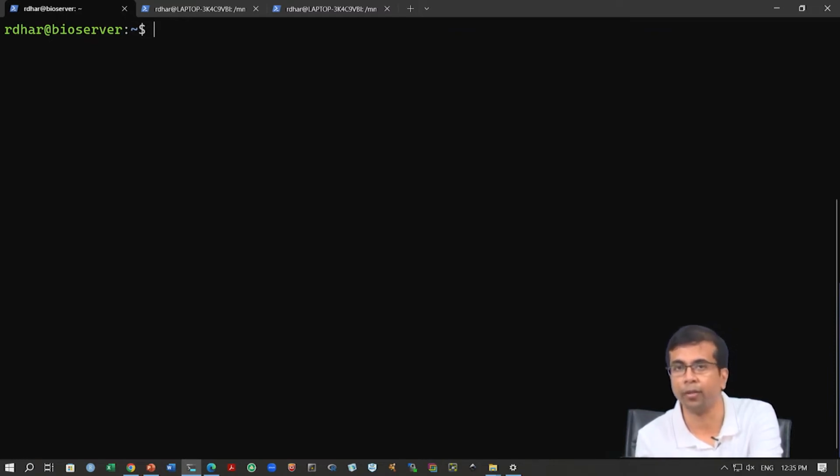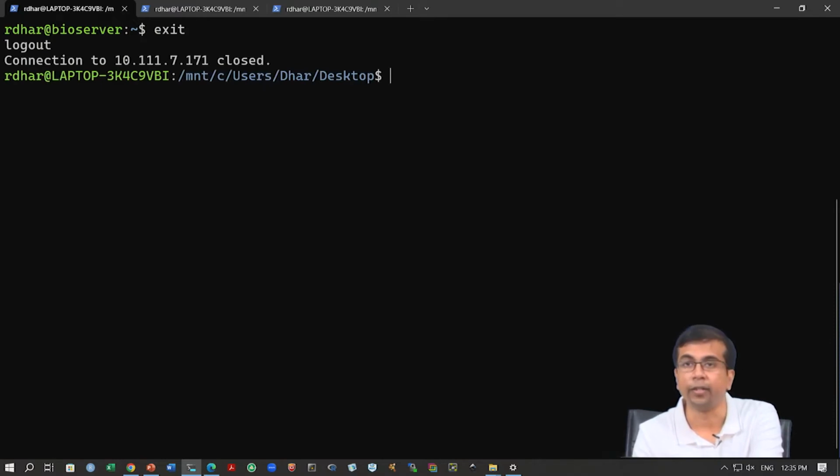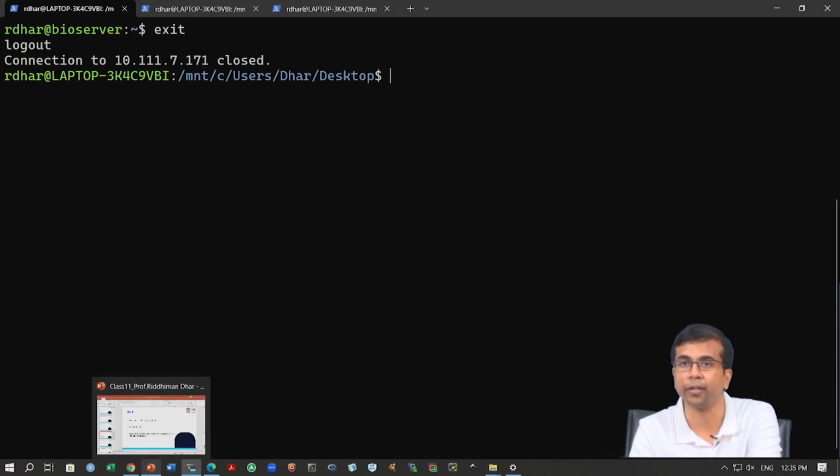So, what you want to start with are the basic commands that you can use for this terminal, or the bash, and these are the basic shell commands. Okay. So, let us now go back to the presentation and look at these basic shell commands, and then also demonstrate these basic shell commands here, and you will see how to use them. Okay.